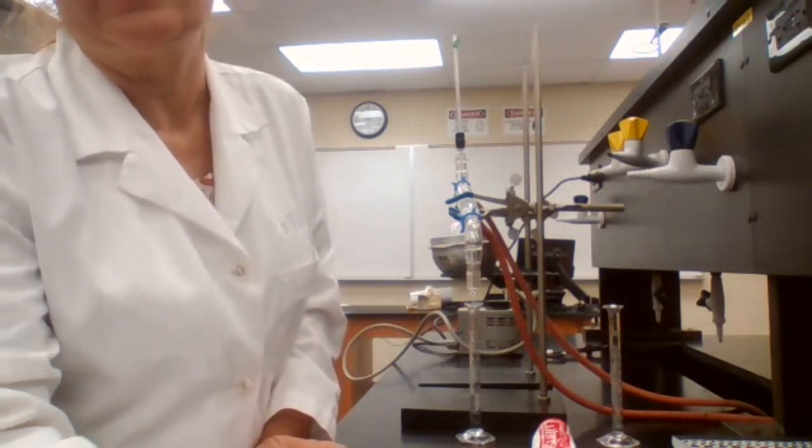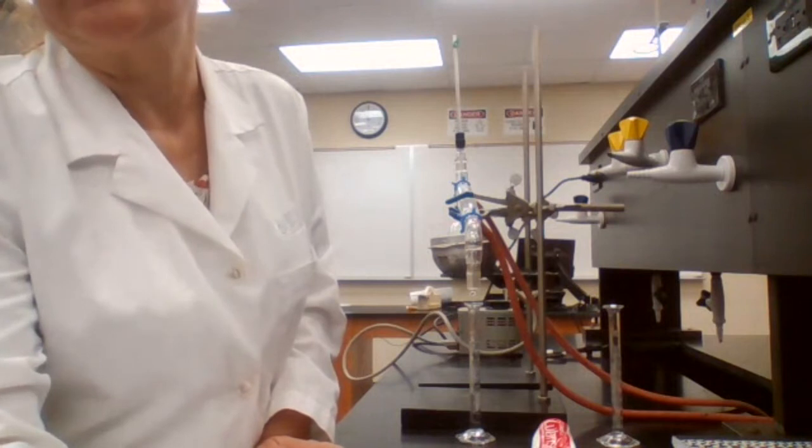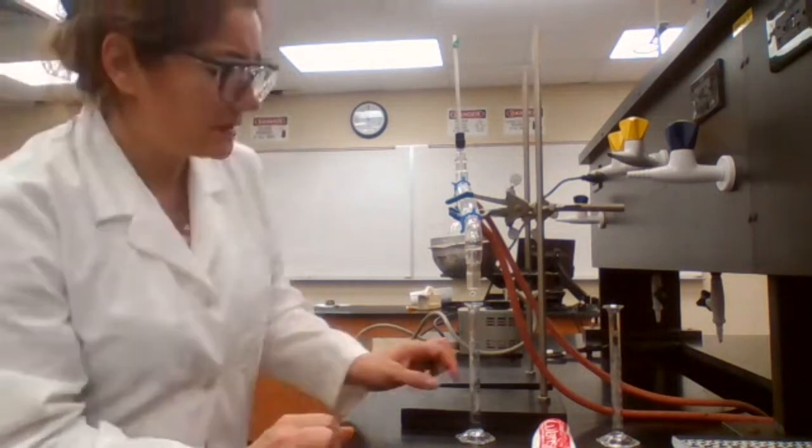So for 3 milliliters, record 65, please. 3 milliliters, 65.